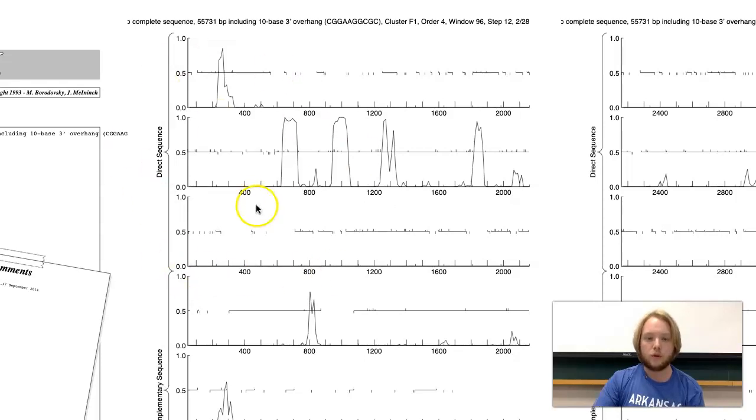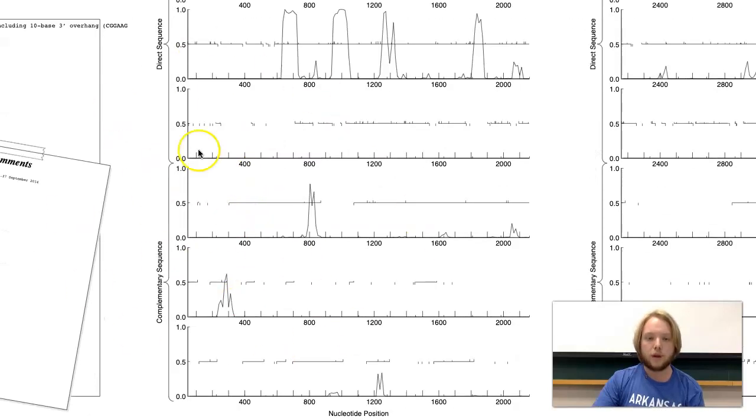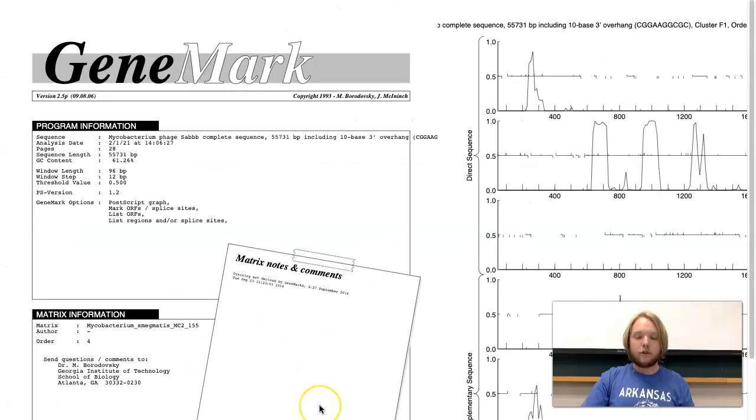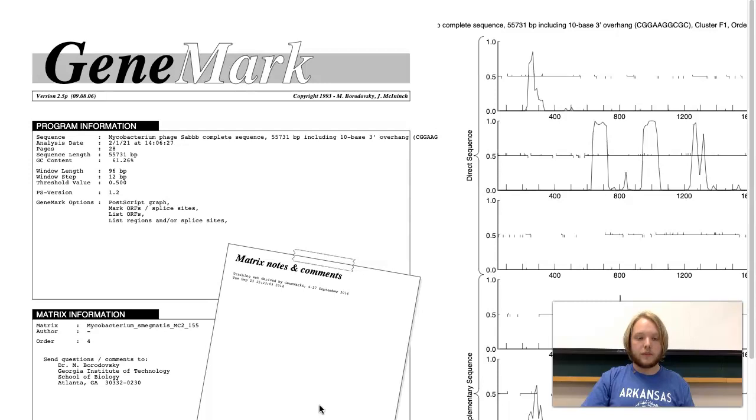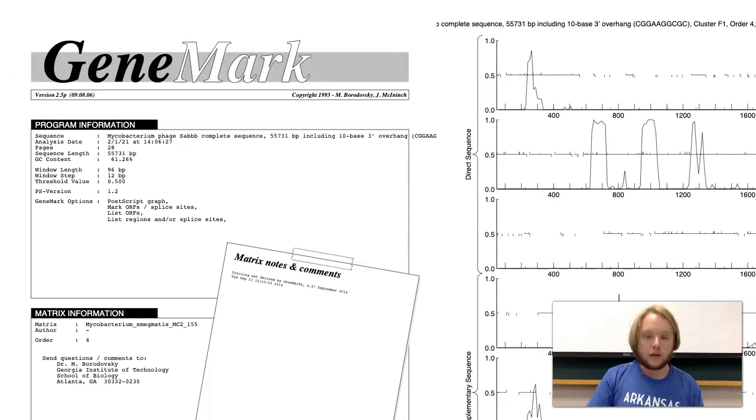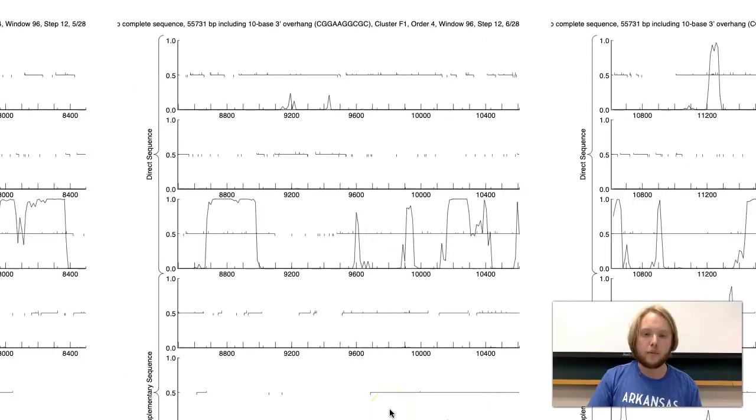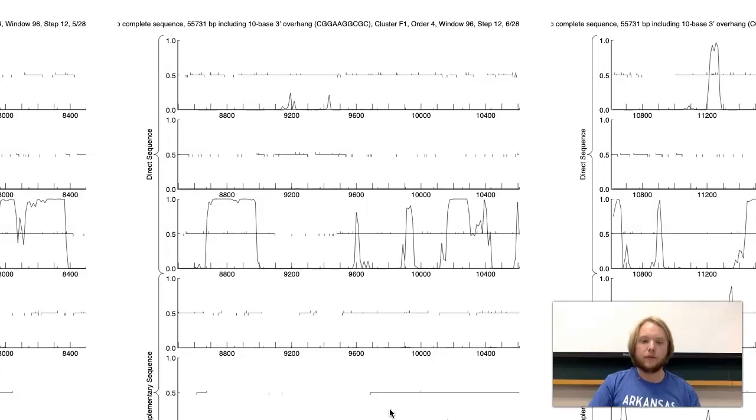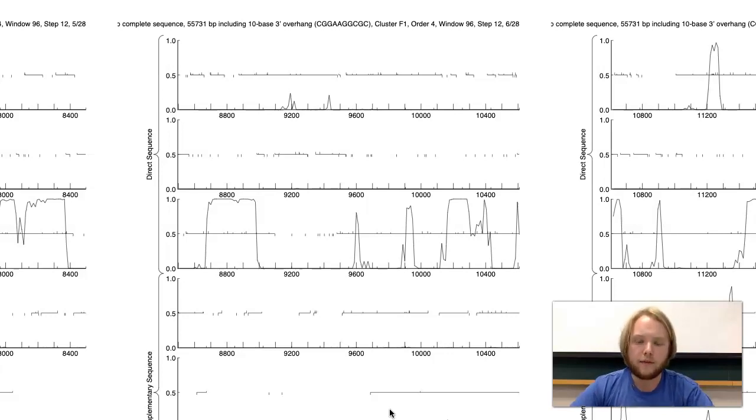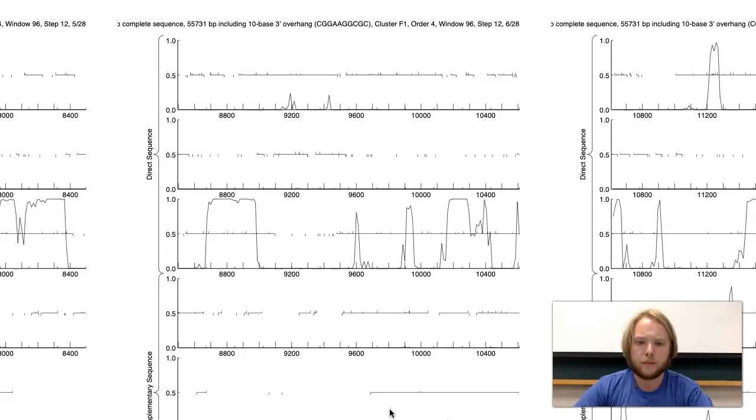These top three go forward, while these bottom three go backward. If you remember from Pecan, the particular protein we were looking at was starting at base pair 9,504. In order to find the start 9,504, we have to scroll over and find it. I've already explained the different reading frames, but now I have to explain why we choose the reading frames we do. And to do that, I need to explain coding potential.